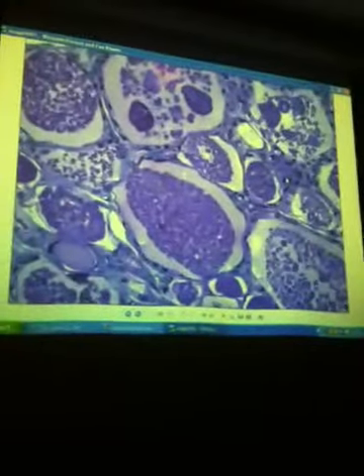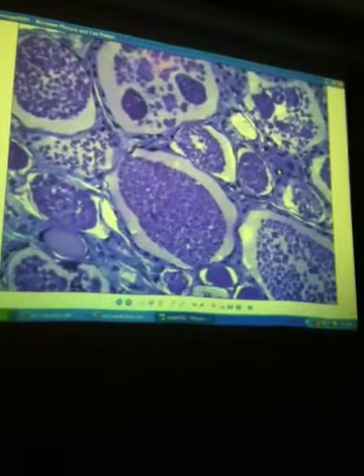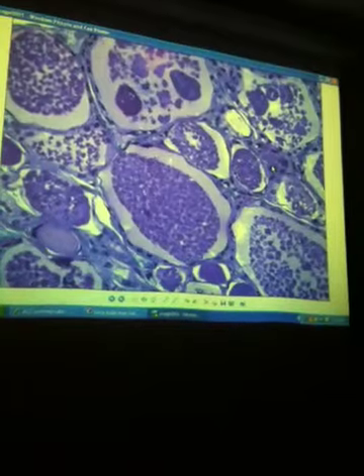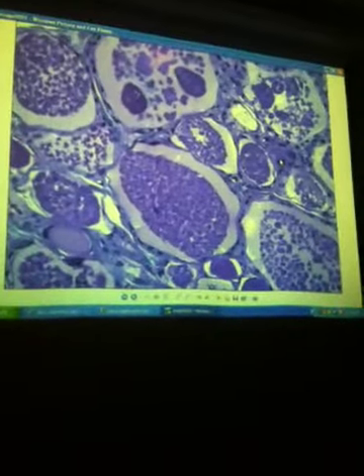Yeah? And you said the follicular ones are squashed? Usually squashed. They'll usually look squashed, and those are the samples that we have. They should look more squamous. Parafollicular cells are usually bigger, but our samples aren't always as perfect as we would like.